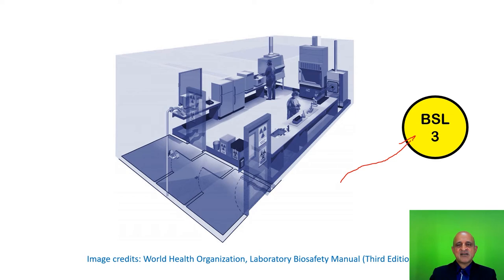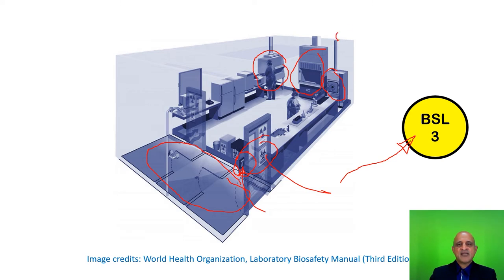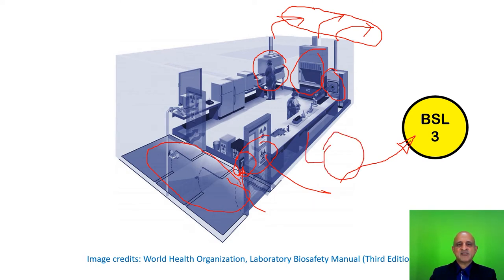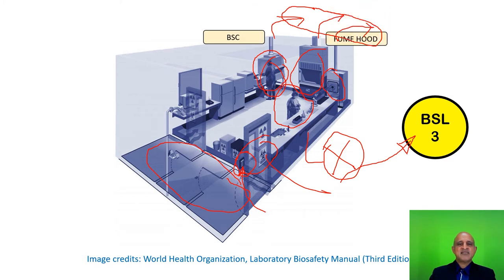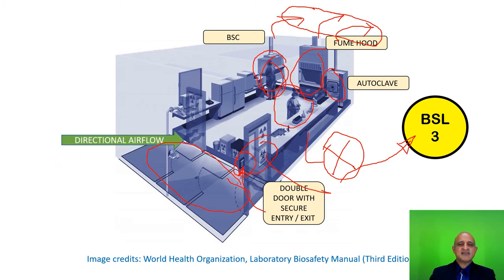Biosafety level 3 laboratories are far more complex as they have directional airflow. Entry into the laboratory is via an airlock with suitable biosecurity and biosafety precautions such as signage and keypad entry. The biological safety cabinet and fume hood are located within, and the autoclave is generally located within the laboratory itself. Everything is hard-ducted out into the environment via HEPA filters. Drainage is released through an effluent disposal system. The technicians and laboratory workers are working with the appropriate PPEs. Key features include the BSC, fume hood, autoclave, double door with secure entry-exit, and directional airflow.